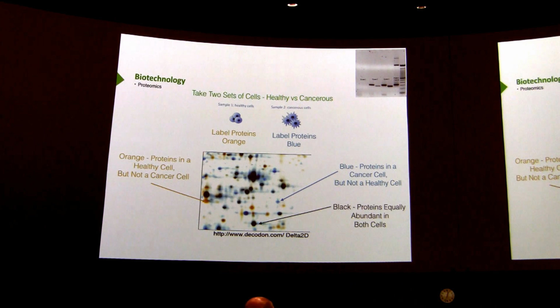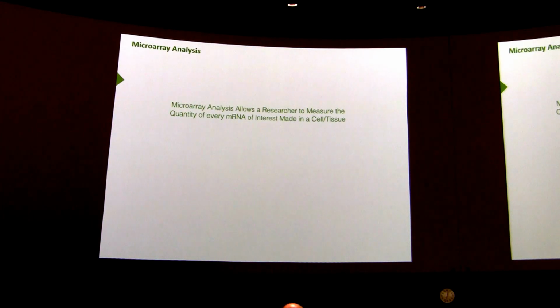All right. Well, we've seen now one way of analyzing proteins at the level of the entire tissue. What I want to show you now is a way of analyzing the amount of messenger RNAs in an entire tissue. This one involves knowledge of complementarity of nucleic acids. They're called microarrays, and microarrays are something that we make in the laboratory for analysis.